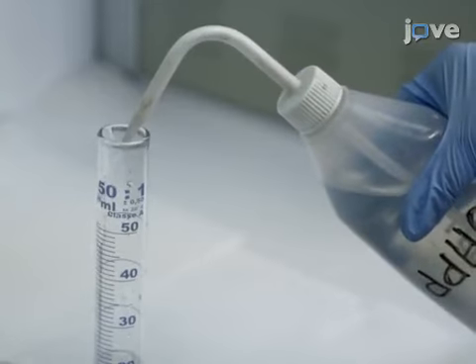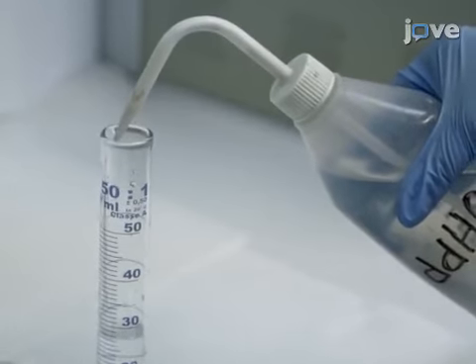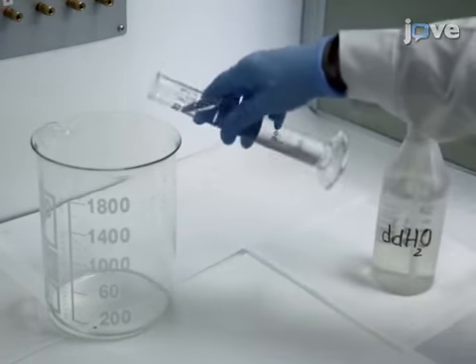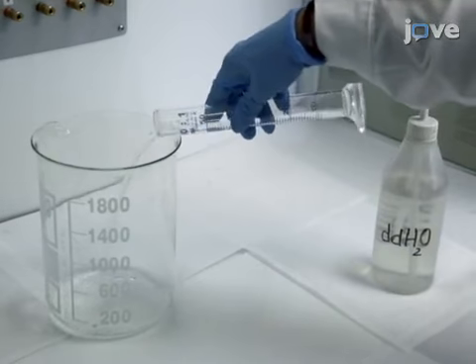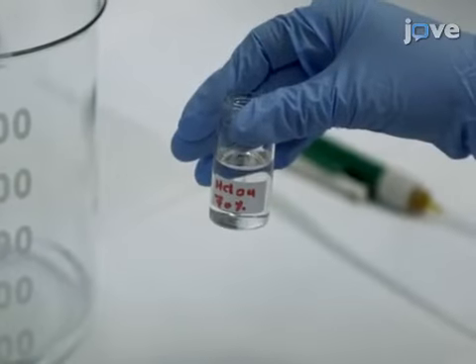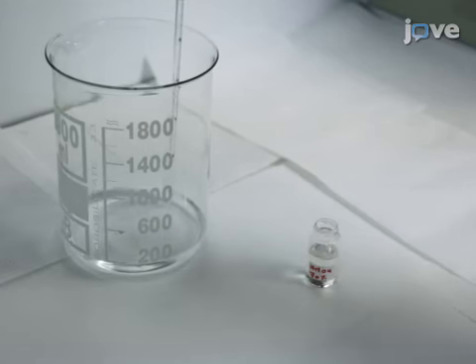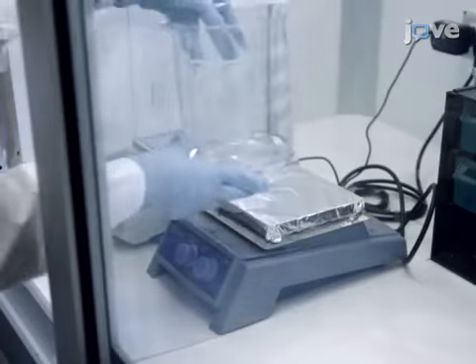To begin nanotube synthesis, in a dry environment, place 187.7 milliliters of double distilled water in a 2-liter beaker. Add 1.3 milliliters of 70% perchloric acid to obtain an 80 millimolar solution, and place the mixture on a stir plate.